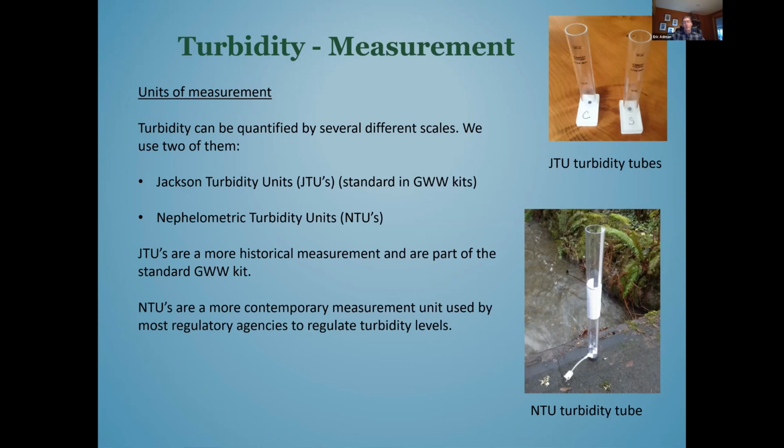The NTU turbidity tube is more useful for higher levels of turbidity, and it is only accurate down to a level of 8 NTUs.